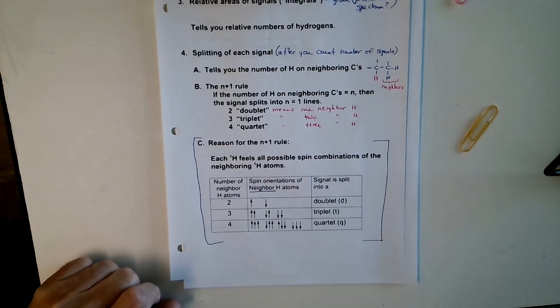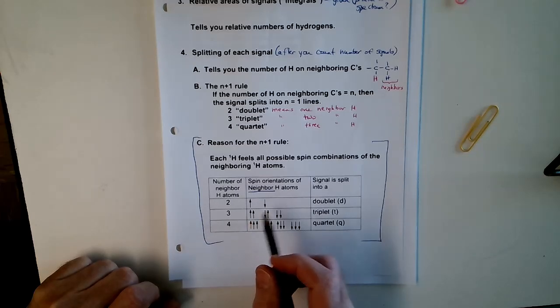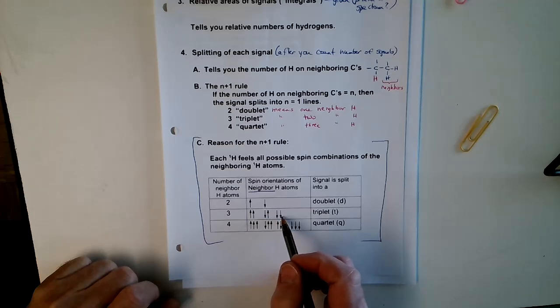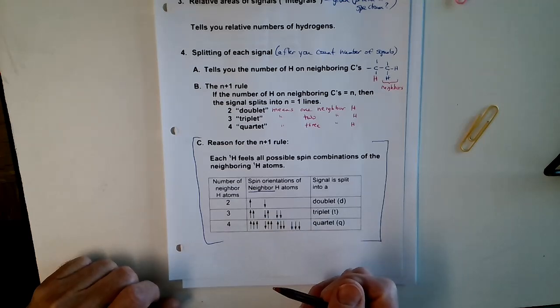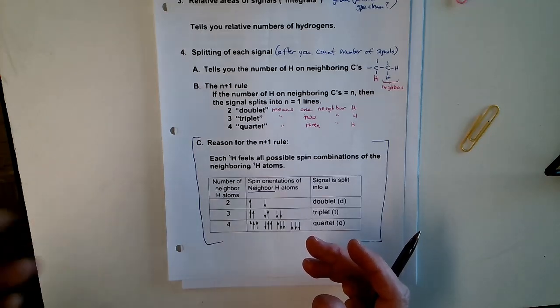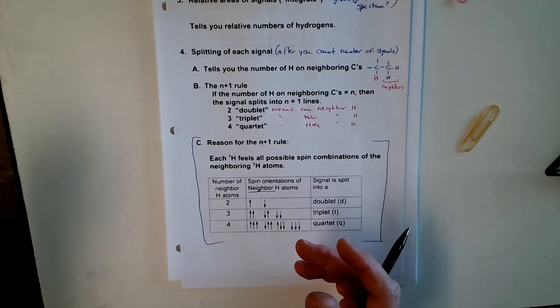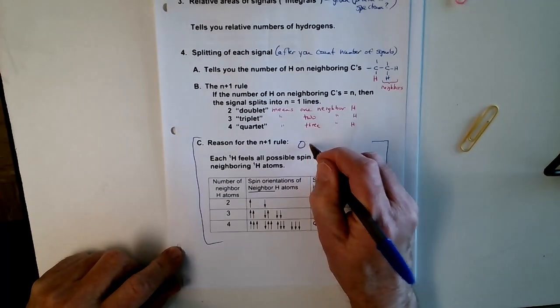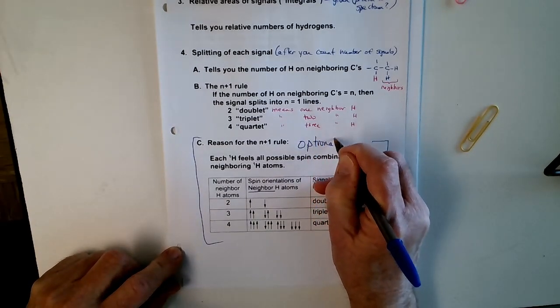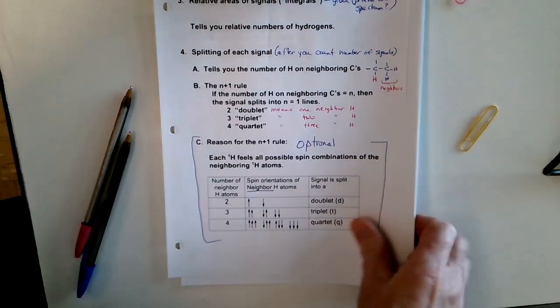And then it gets more complicated from there, because if you're talking about 3 neighbor hydrogens, it could be like, well, here's one way to have them, and here's another way to have them, and here's another way to have them. Your neighbors have different ways of cooperating with or opposing the external field, and that makes the difference in the signal that you actually see. Like I mentioned, this is optional, so we won't spend much time on it. It's just a way of saying there's a good reason that we're about to see what we will.